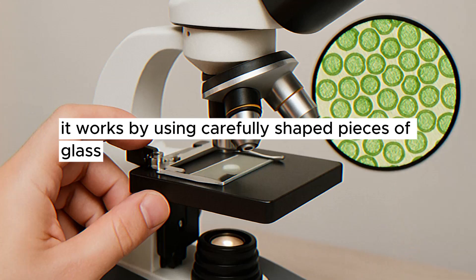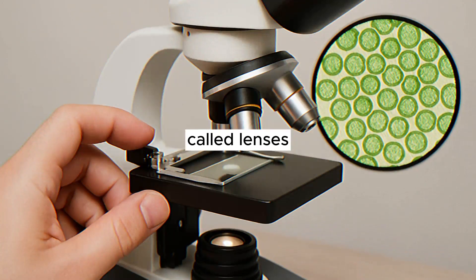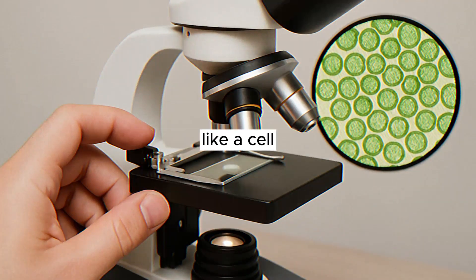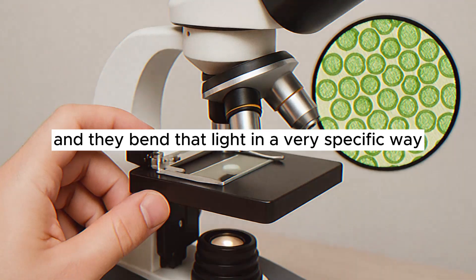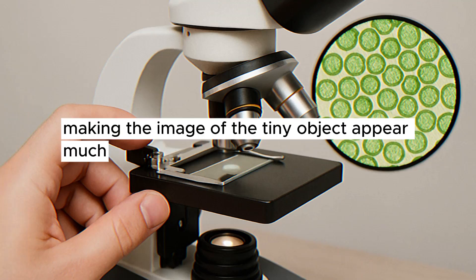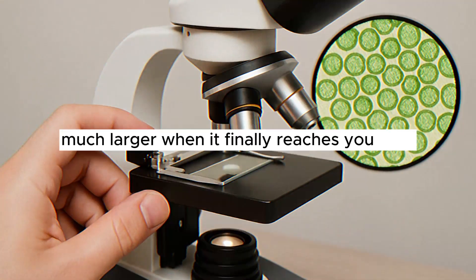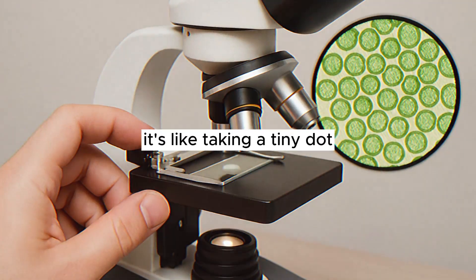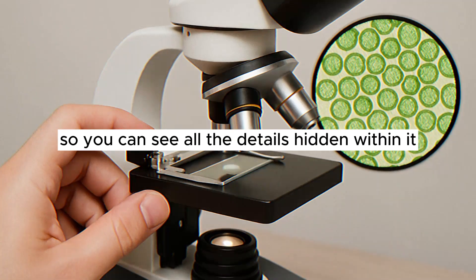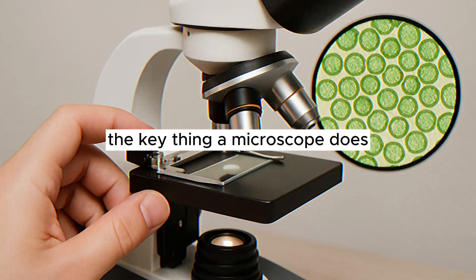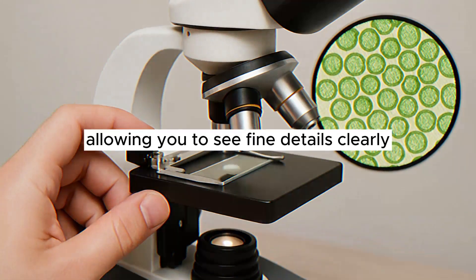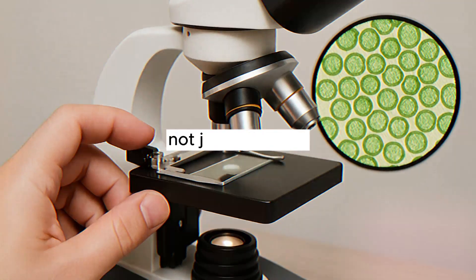It works by using carefully shaped pieces of glass called lenses. These lenses capture the light bouncing off or passing through a super tiny object, like a cell, and they bend that light in a very specific way. This bending action spreads the light rays out, making the image of the tiny object appear much, much larger when it finally reaches your eye. It's like taking a tiny dot and stretching its picture out over a bigger area so you can see all the details hidden within it. The key thing a microscope does is provide magnification, making the small look big, and resolution, allowing you to see fine details clearly, not just a big blur.